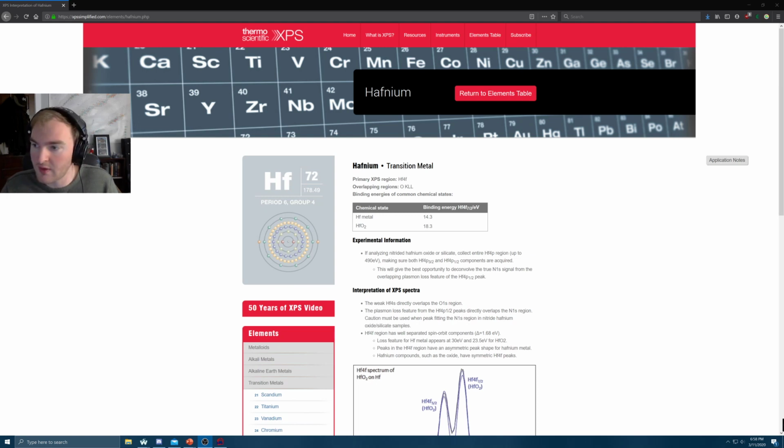And then I will go through a brief overview of the steps that are required to go from the output data from the XPS to using CasaXPS to finally generate a report of whatever you need into Excel, so that you can use it in presentations.